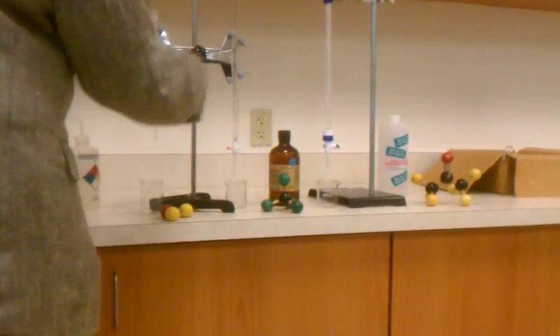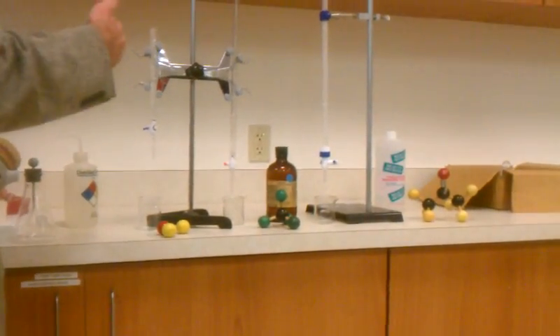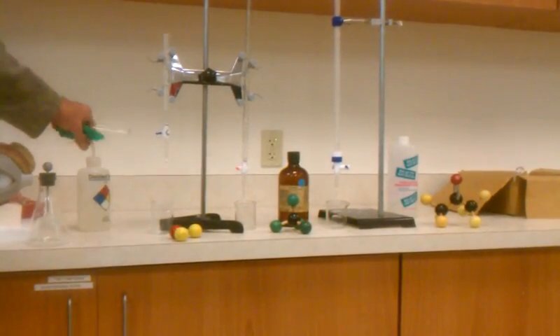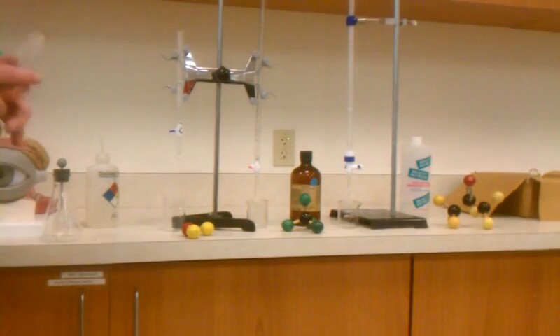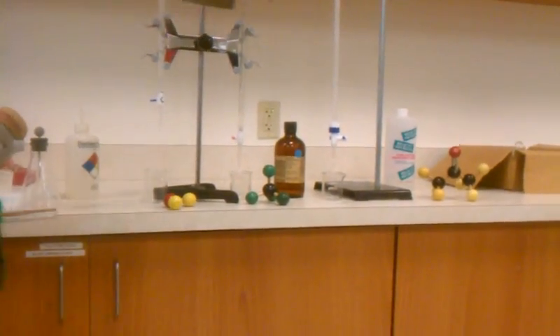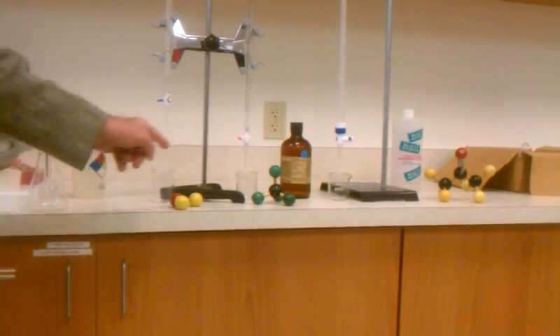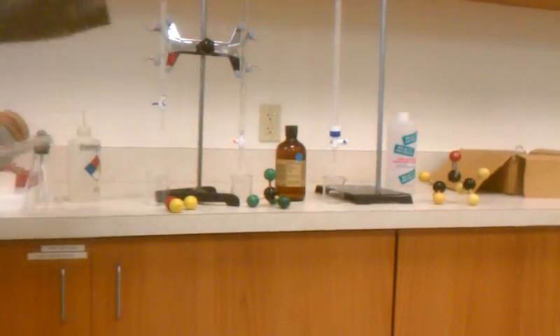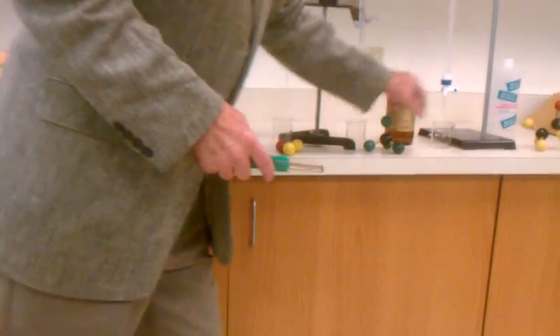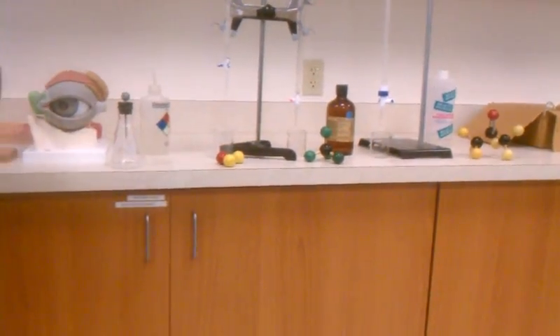If you haven't caught on to what equipment I've got, these stands are holding the 3 burettes, and in each of the 3 burettes I have a sample of each of the pure compounds. I have pure liquid distilled water, I have pure liquid carbon tetrachloride, and I have pure liquid acetone. And the only reason I put them in these devices is so I can make a fine stream. I've got these little beakers down here to catch the stuff that's running off. And I made these models of the compound so that you can visualize what I'm working with.